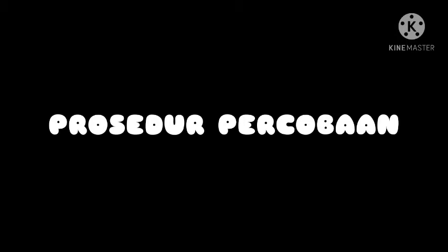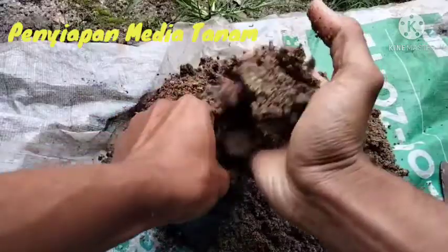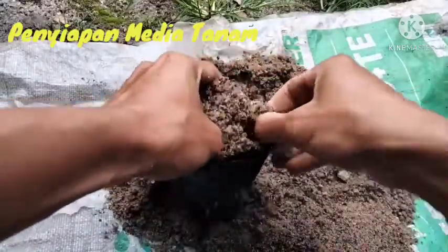Prosedur percobaan. Disiapkan bak perkecambahan atau polibag dan diisi dengan pasir sebagai media tanam.